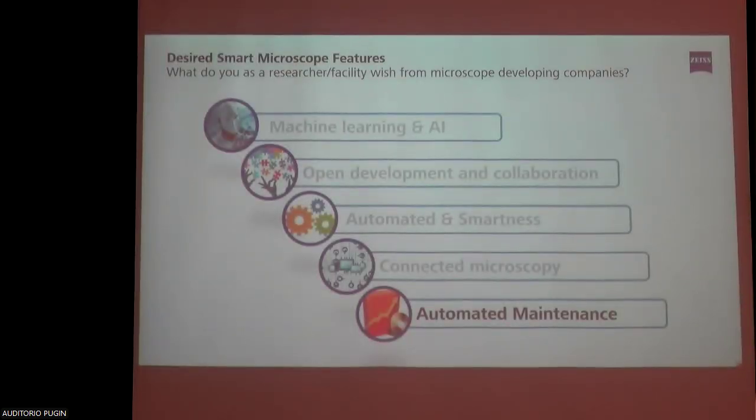And the last topic, maybe not too important for the majority of you, but for the microscope supervisors, is automated maintenance. To make the relevance of that topic appealing to you, some of us have a car. And what we don't want is that the car breaks down and we don't have a car, because we often need the car to get somewhere. With a car, we typically have an inspection every year, or every 2 years. But what if we had some artificial intelligence, or some kind of service, running in the background that is basically checking whether a problem might be coming up?